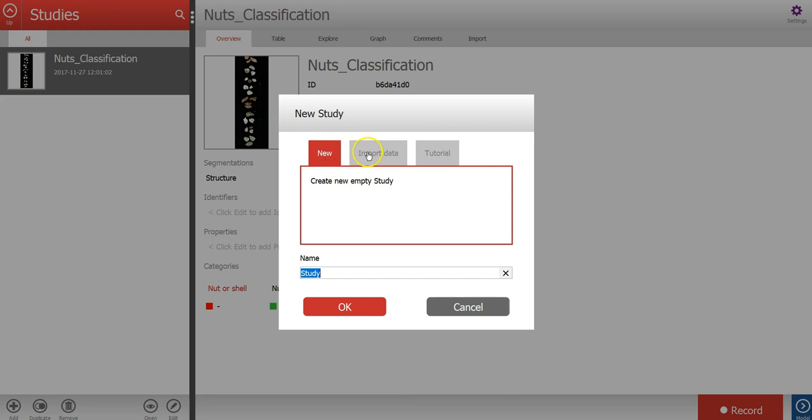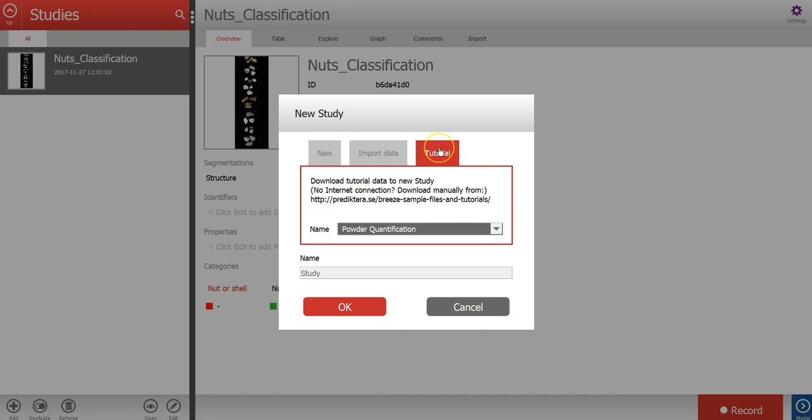Or import previously recorded external image data from your hard drive, or finally you can download tutorial data from the internet, and this is what I'm going to do here.